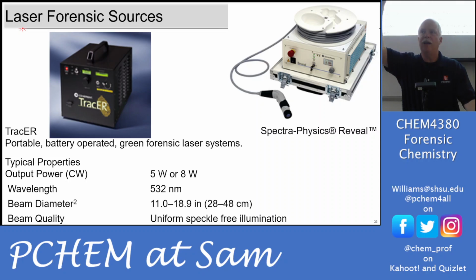But a laser is going to send all of its power in a straight line, though you defocus it a little bit. And so with one of these, I could stand pretty far back with my glasses on and see evidence. So I wouldn't have to walk over to a contaminated area. I could search better if I had a laser. It's just so much more bright. That's where you would want one of these lasers.